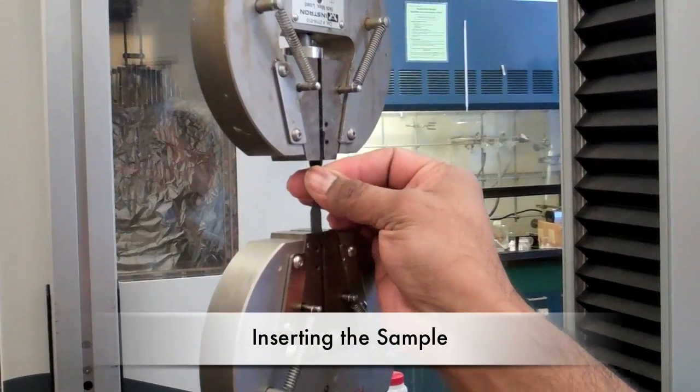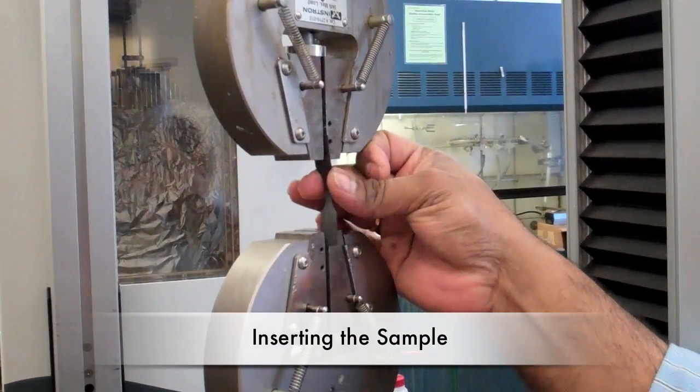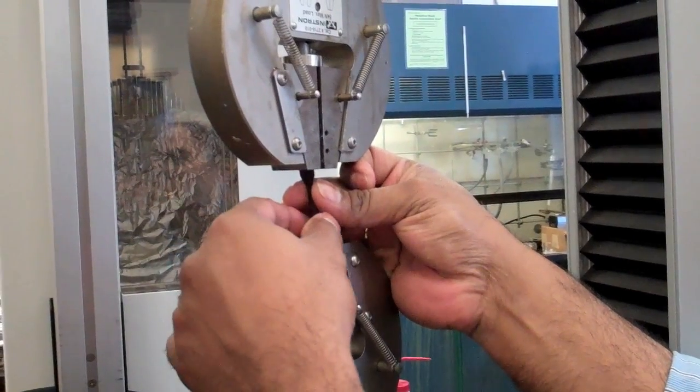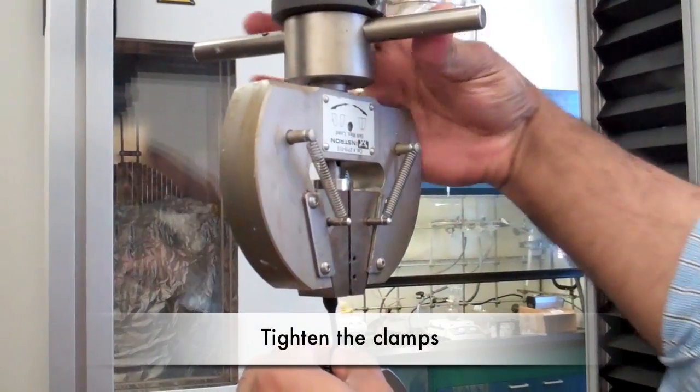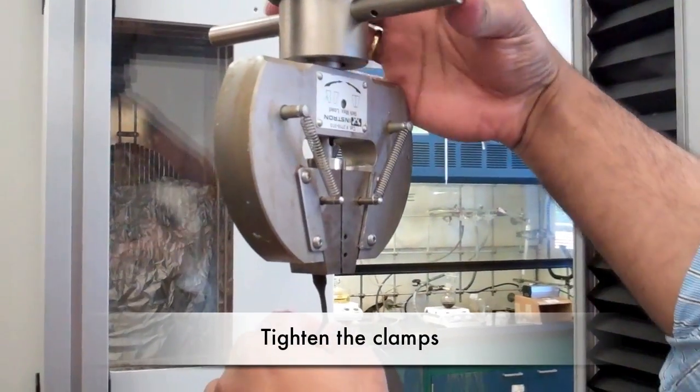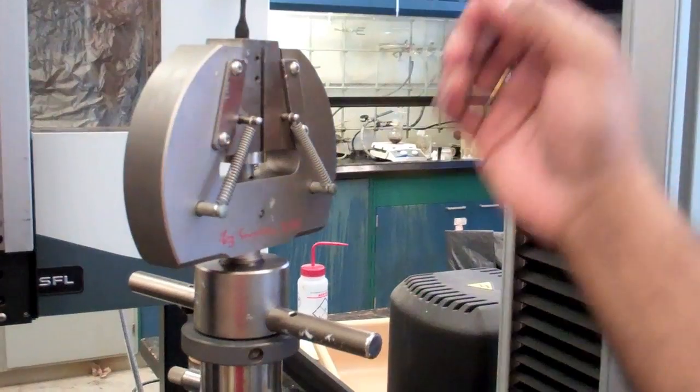Next, the sample must be inserted. Typical gauge lengths are about 40 millimeters, so the clamps should be positioned accordingly using a micrometer or a ruler. Position the sample in the middle of the clamps and tighten the top clamp first using the bar at the top, then tighten the bottom clamp.